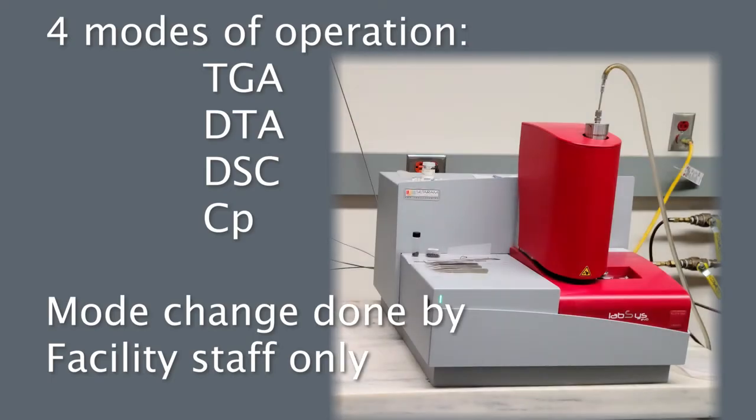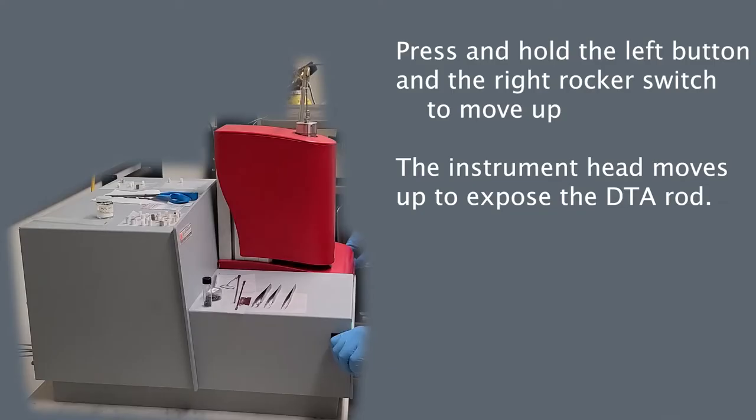There are four modes of operations for the Lapsys EVO: TGA, DTA, DSC, and CP. Here we're going to show the DTA mode.